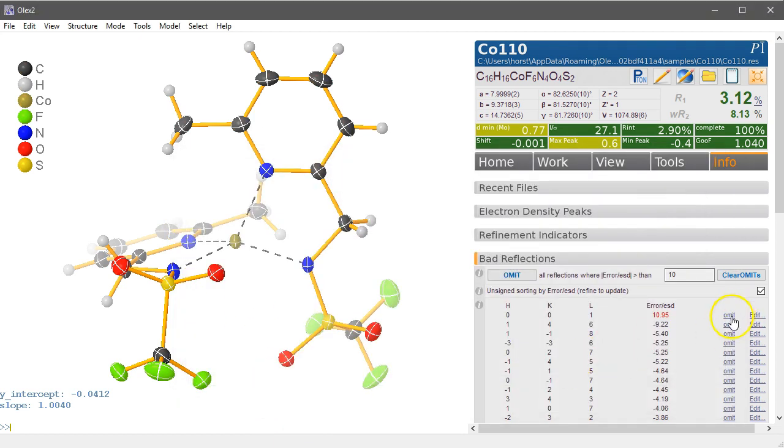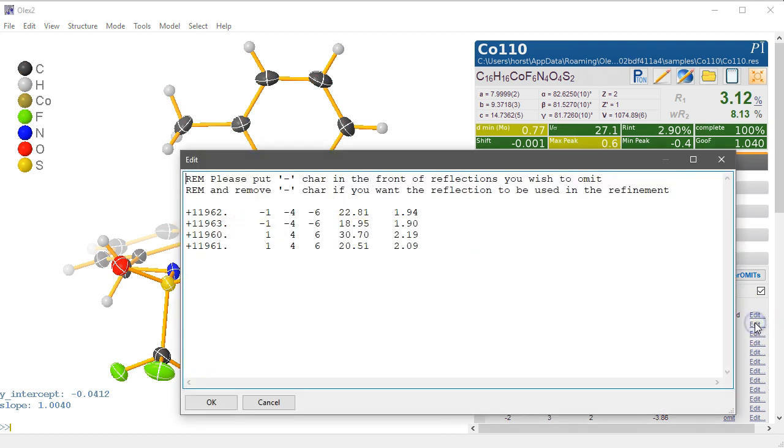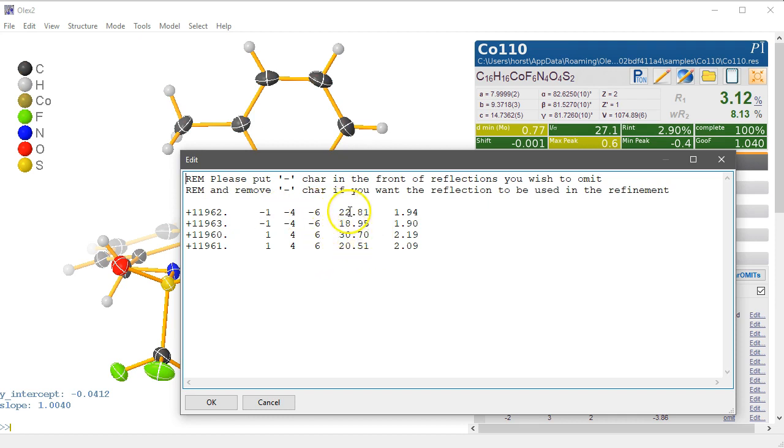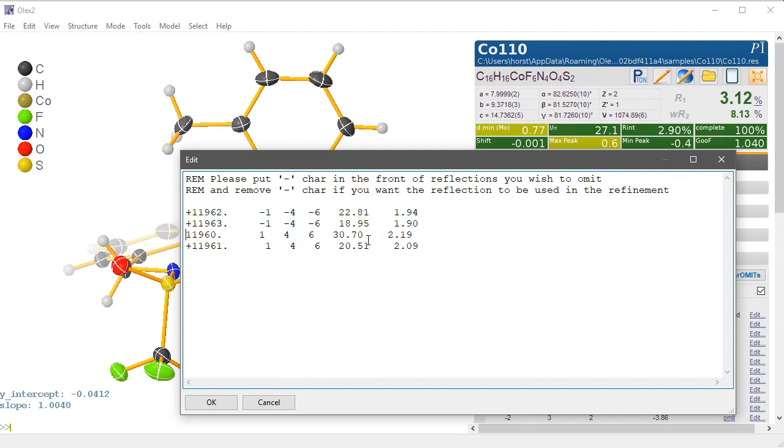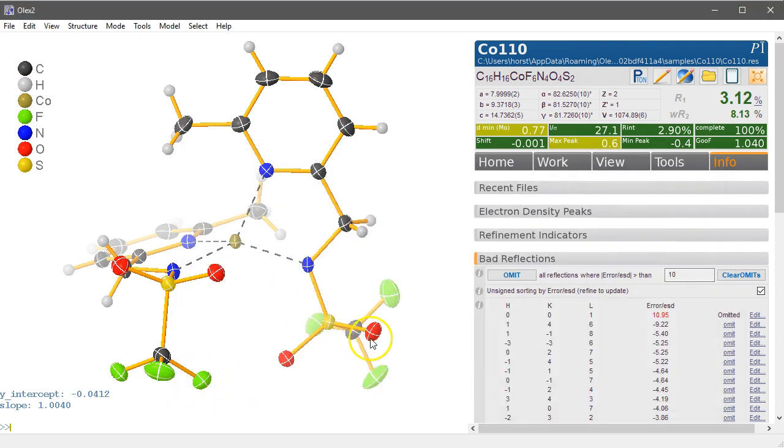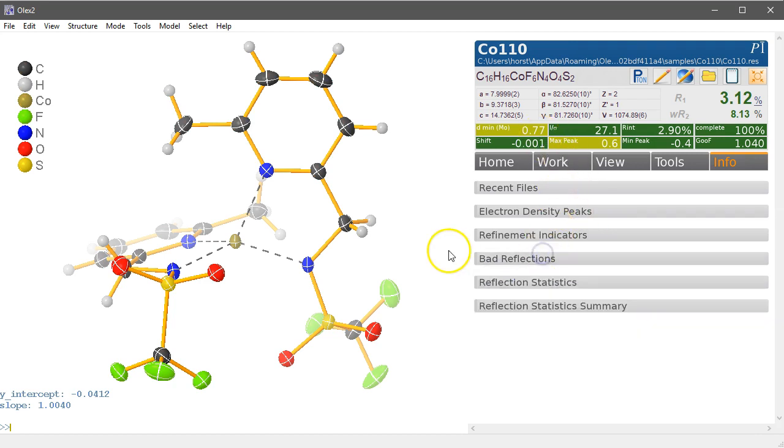For this one here we can see there are four equivalents, and one of them, the 30 here, that looks a bit bigger than the other ones. So 22, 23, 19, 30, 20. So this is probably the one we want to omit and we can turn this plus into a minus, and that doesn't omit all of this whole reflection, only this one occurrence.